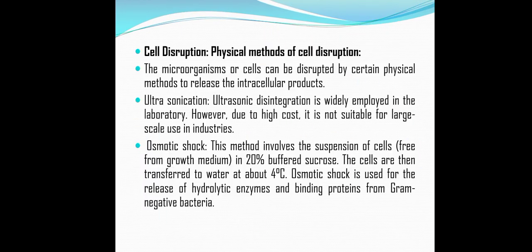Now firstly we are focusing on the physical methods for cell disruption. The microbial cells can be disrupted by using certain physical methods for the release of the intracellular product. The first method is ultrasonication. Ultrasonication is widely employed at the laboratory scale, but due to its high cost it is not suitable for large scale use in industries.